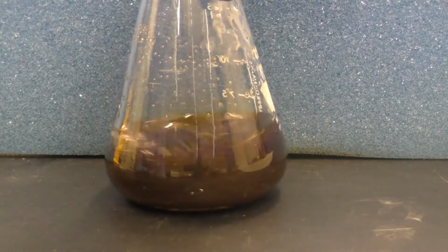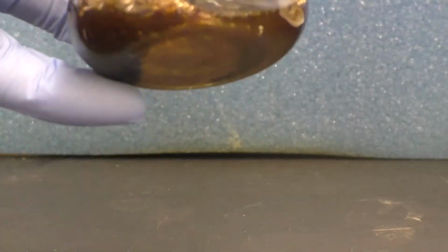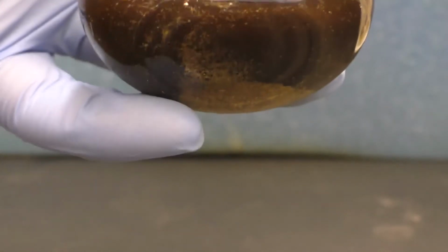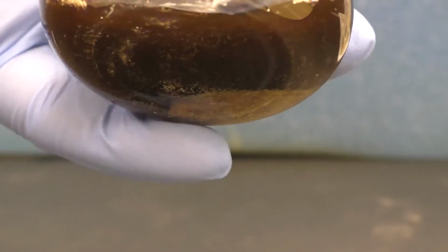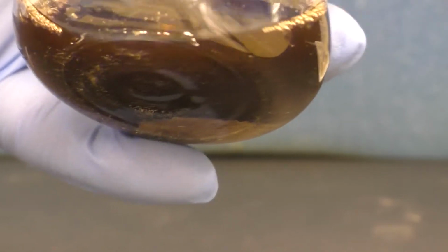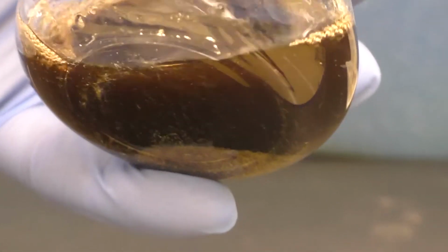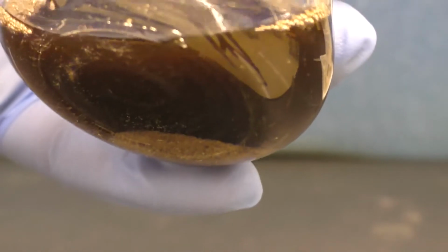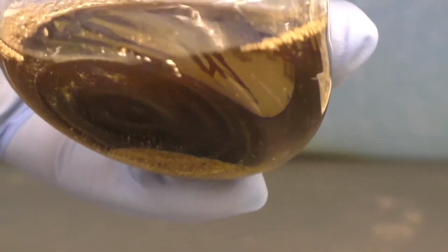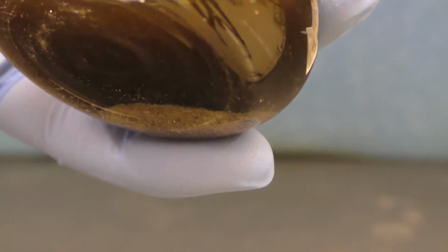So we've been swirling this for a while, and something interesting has occurred. Not everything is fully soluble, so if we flip this over and see the bottom here, you can see there's some whitish solid there that is not dissolved along the bottom. Now, this is both a good thing and a bad thing. On the good side, it's certainly less colored. So you can see the black material has dissolved, but this much lighter colored material has not fully.